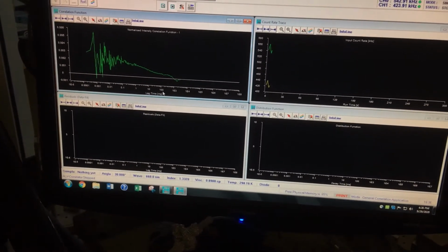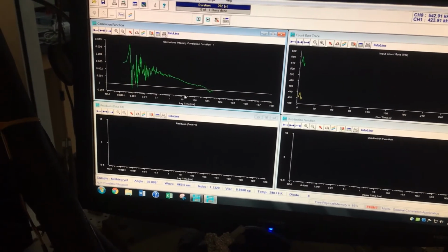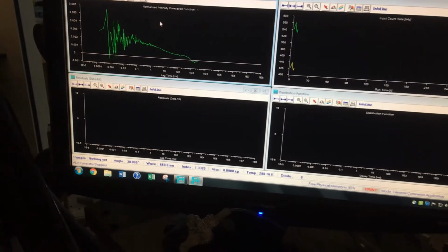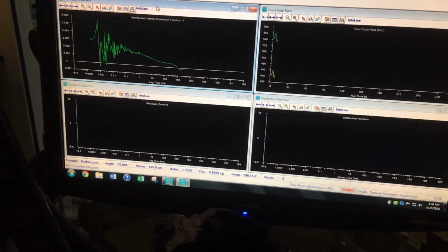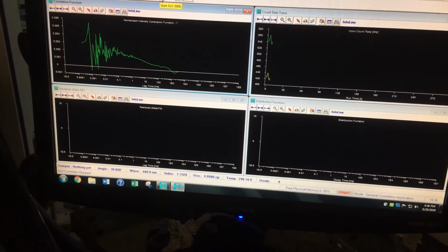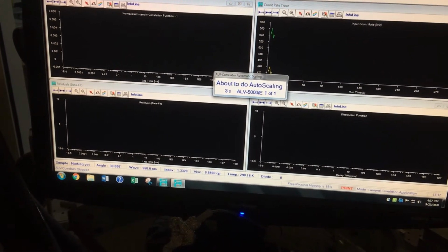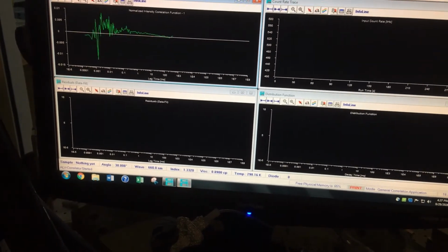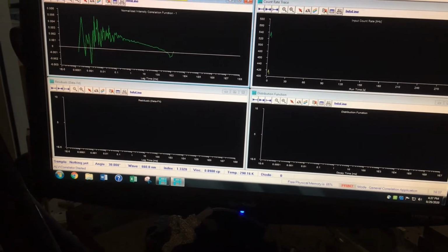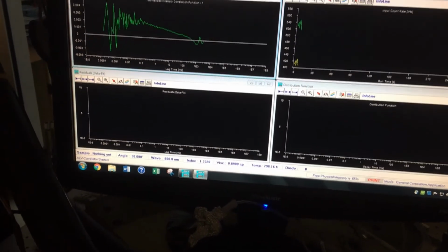The shortest they could be, if our decay time is a millisecond, we could do individual runs of 10 seconds or so, maybe 20 seconds. And then you would sum those, and I bet you would wind up using a fitted baseline anyway. Often in these heterodyne experiments, you want a fitted baseline. But anyway, the signal is immediately available. And we'll let it run for a little while.